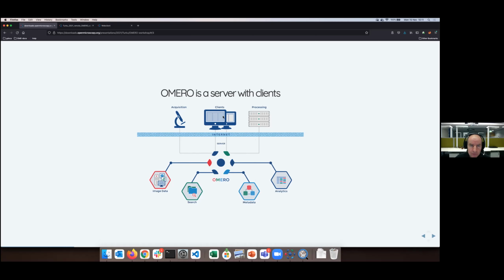Each of you sits in front of such a machine now, and the laptop or desktop has an application which is able to connect to that server. In our case, this will be OMERO Insight, the Fiji plugin, and QuPath, and this application then connects via the internet to the server and lets you do stuff, so to say, browsing, viewing, analyzing, etc.